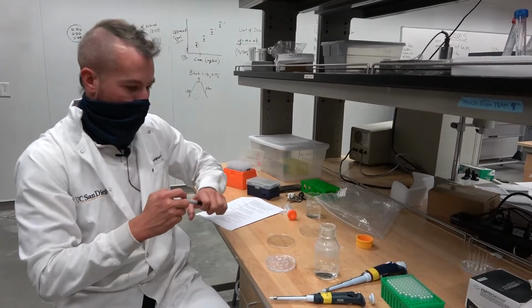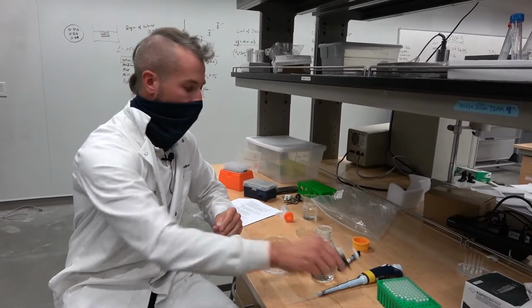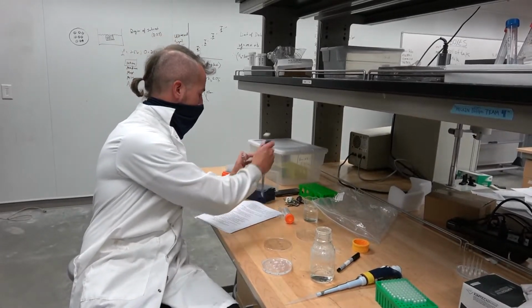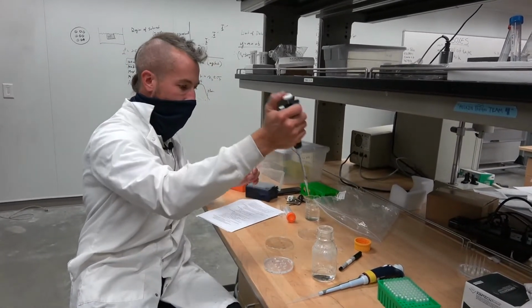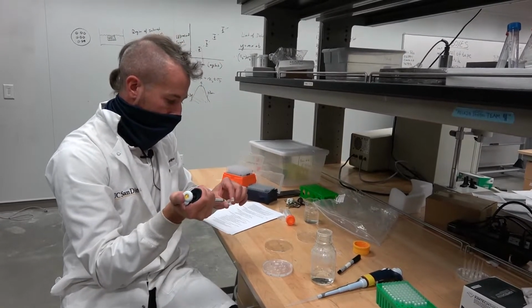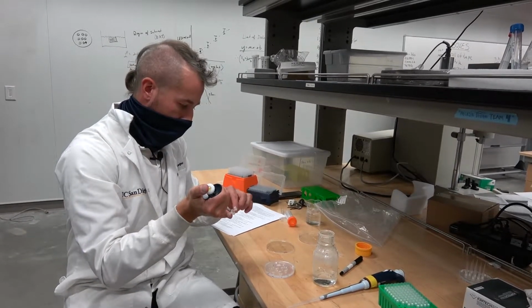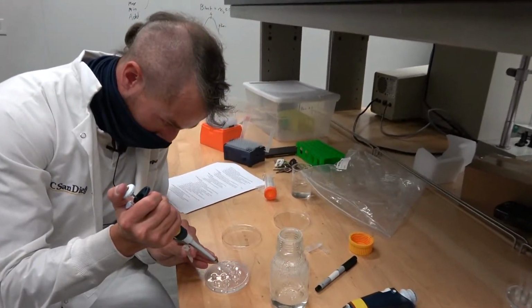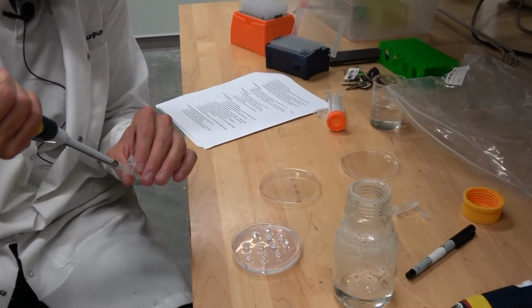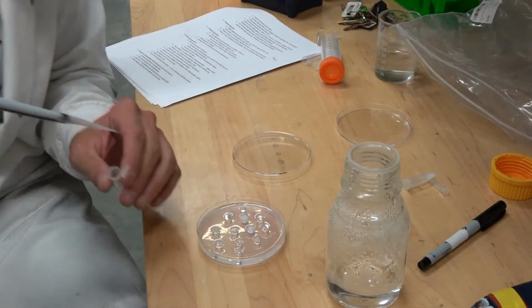So now let's do our 1 to 2. This again is 200 microliters. So I'm going to add another 200 microliters. Carefully mix it. And in it goes.